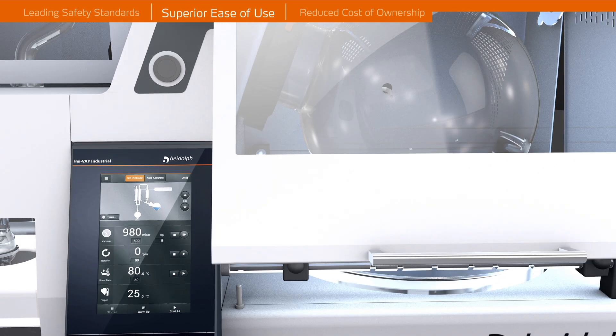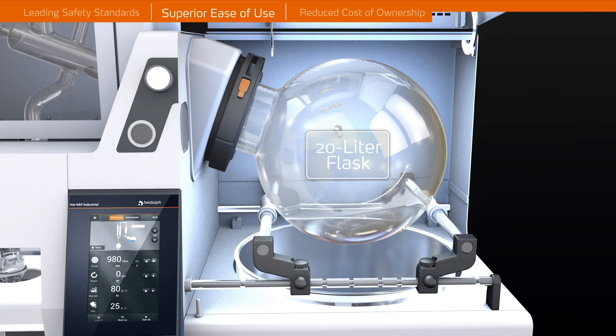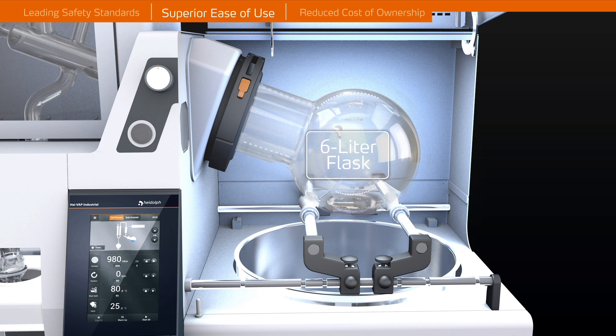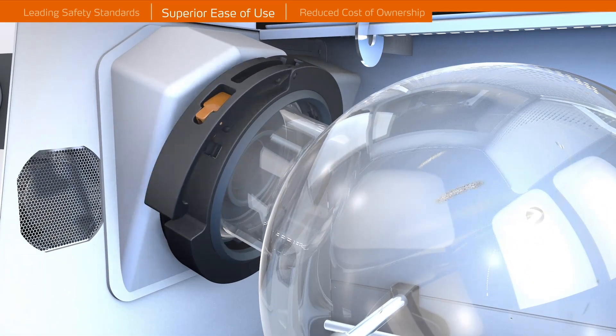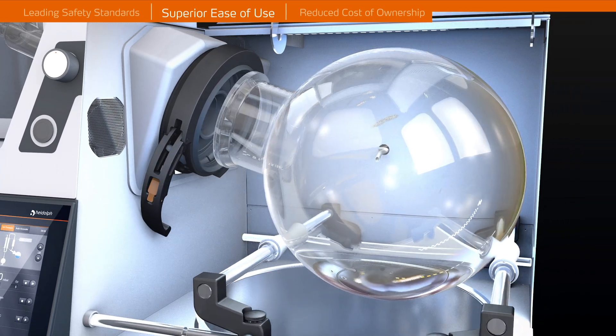Superior Ease of Use. All HiVap industrial models are equipped with a newly developed intuitive and safe flask removal system. Integrated markings and indentions allow for easy adjusting of handles specific to which flask size you are working with. The Easy Lock System ensures your evaporating flask is in proper position and locked.